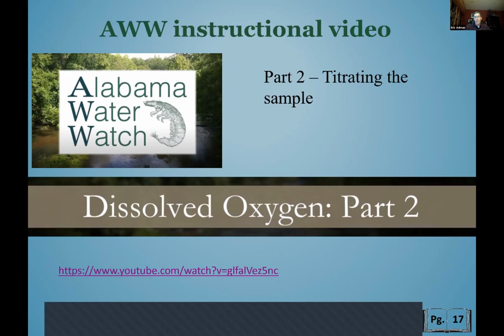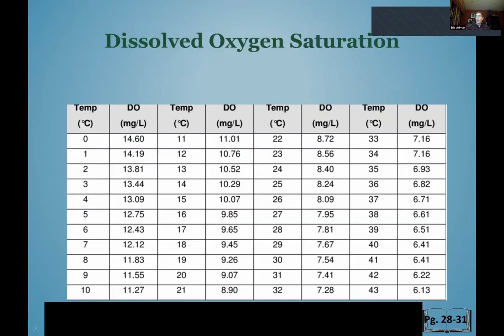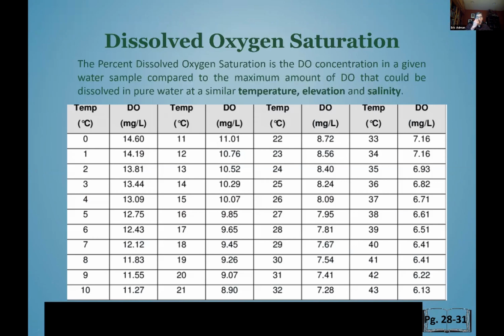Okay, we're just about done here. There's just a little bit more to go through, and then we'll talk about what comes next. So once you've done those tests, then the next thing that you do is calculate what's called dissolved oxygen saturation.